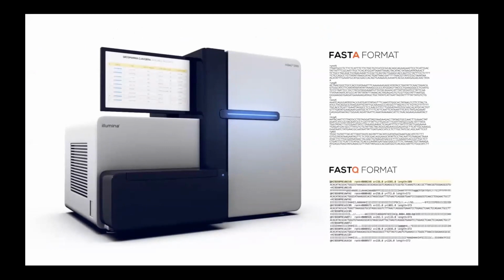What does this data really look like? So the data really comes from a sequencing machine that looks something like this. This is the HiSeq 2500. And the HiSeq 2500 produces FASTQ format of data. When we say it's unstructured, it looks like this. So it essentially has reads. These short reads can be anywhere between 30 and 300 base pairs long. And for each one of these letters that you see here, you have a quality score as well. And that's why it's called FASTQ.